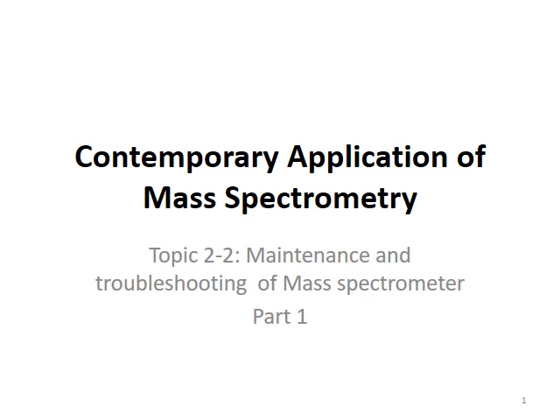In this new topic, we shall discuss a few tasks that may help you to keep your LC-MS instrument working continuously and minimize the downtime. I believe this topic is of very practical use. Specifically, you will learn how to maintain your system, and if there is something wrong, you will know how to trace the causes of the problems.